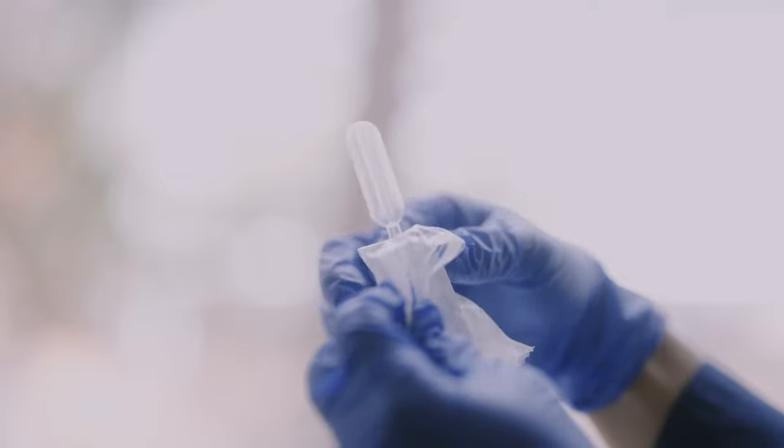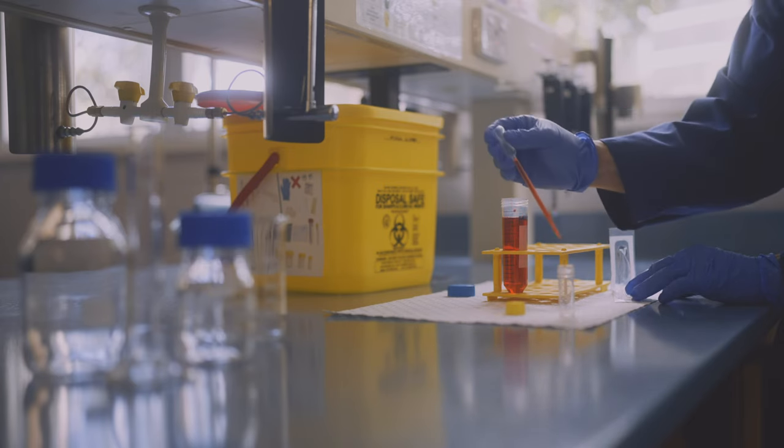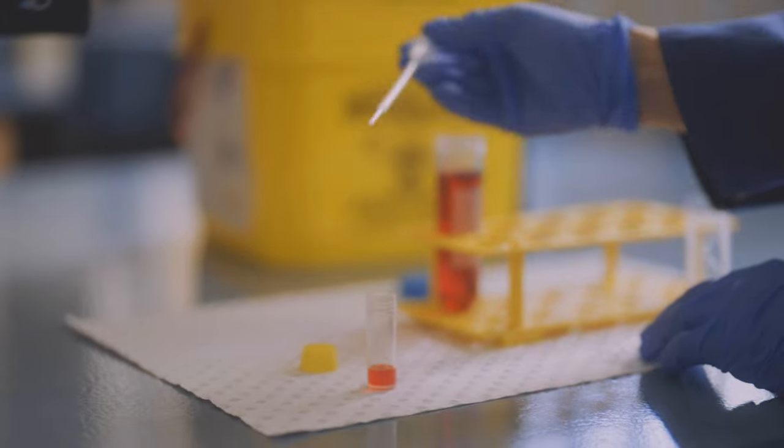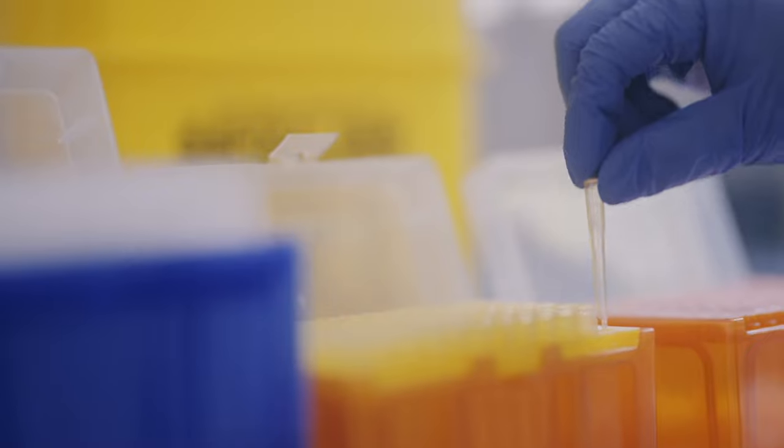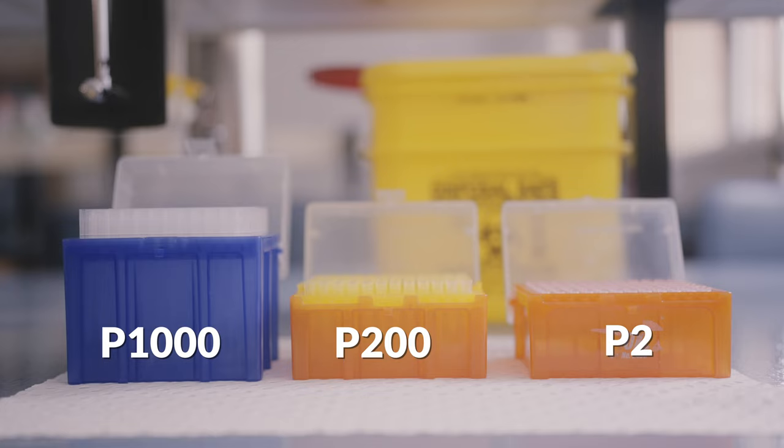Coming back to smaller volumes of liquid, pasteur or transfer pipettes are very quick and easy. They're often single-use and pre-sterilized, lowering the chances of contamination. There is much less control though, with no clear indication of volume dispensed. Standard pipettes are much more accurate, and there are a variety of pipette tips for different types of pipette — P2, P200, and P1000 are shown here.